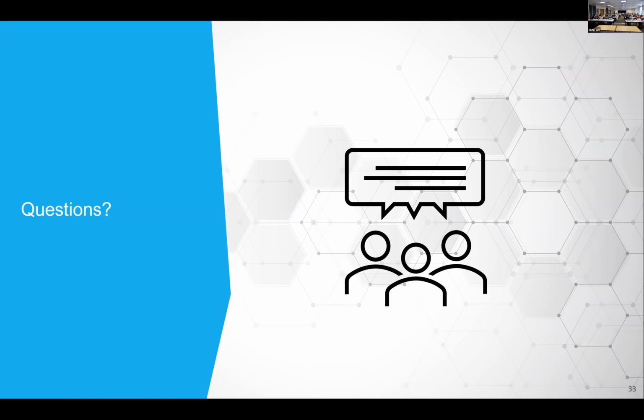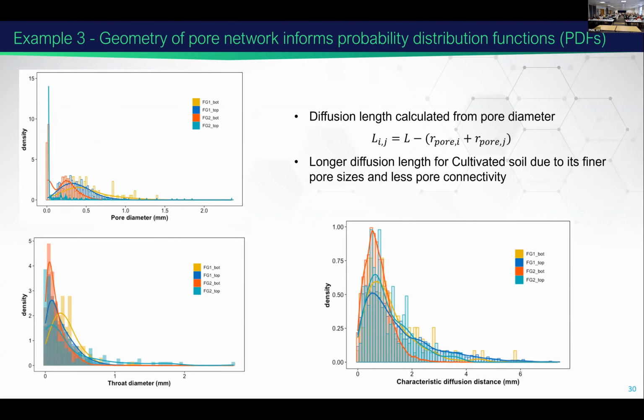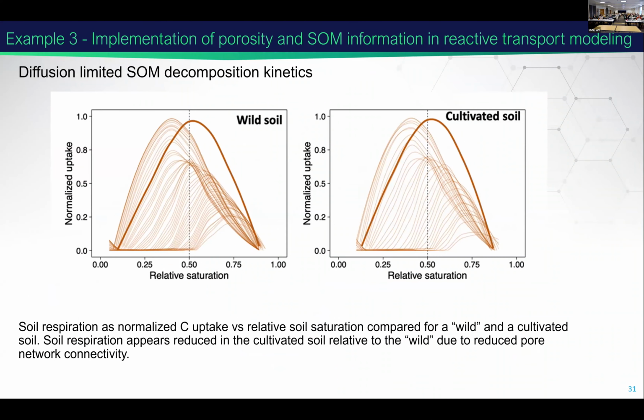Back to the one slide or two slides before where you showed the graph. I didn't understand that. Could you explain it a little more slowly since we have time? What's going on there? No, the next one. No, yeah. Can you say that again? How are we supposed to interpret this?